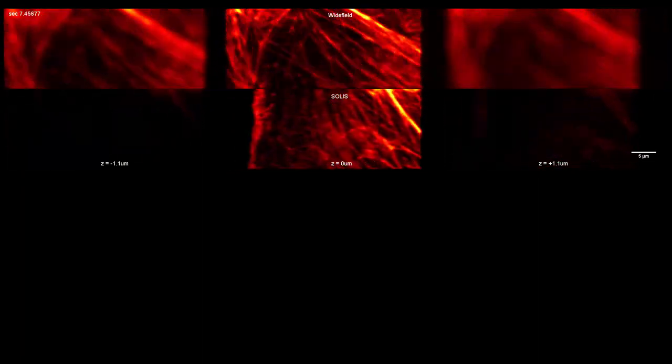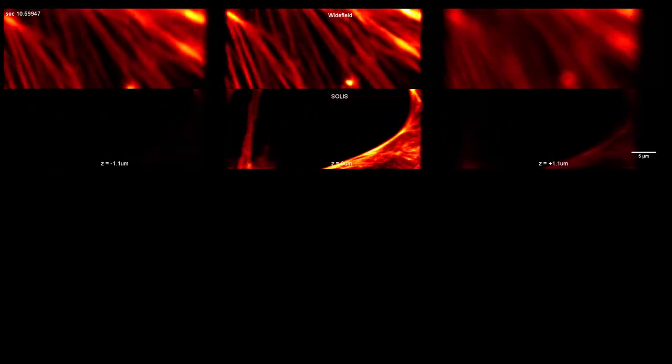And in practice, it looks like this. You can scan with basically the frame rate of the camera through a sample and you get optical sectioning. In the top, you can see a normal cell with actin stain and the bottom, same cell, but now we triggered the camera and the light sheet at the same time. You can do the same thing in a different sample.